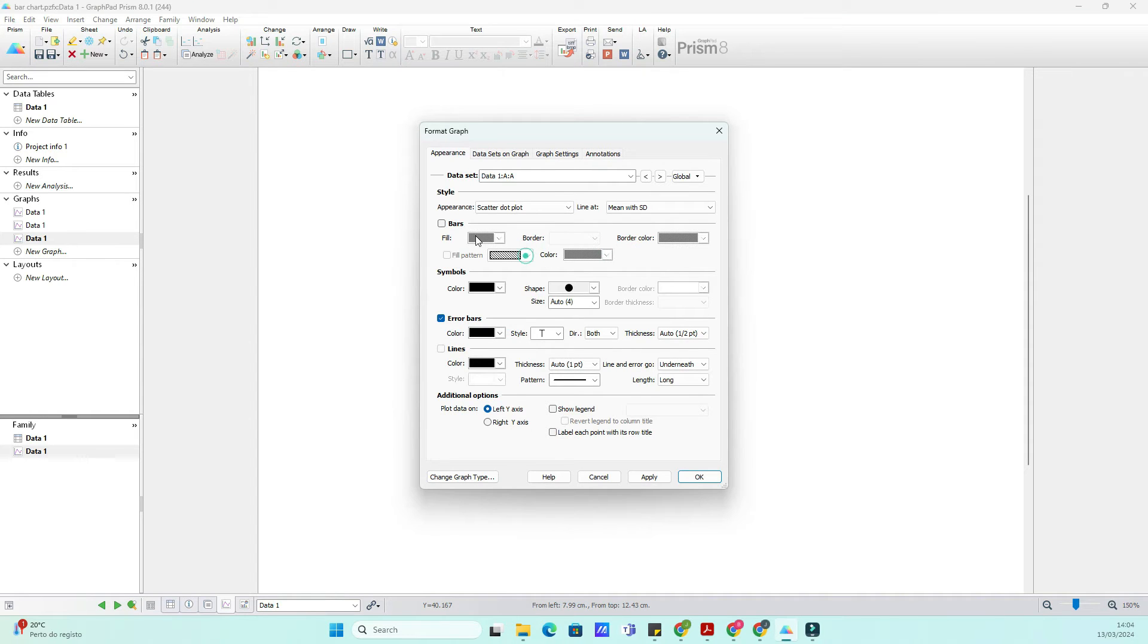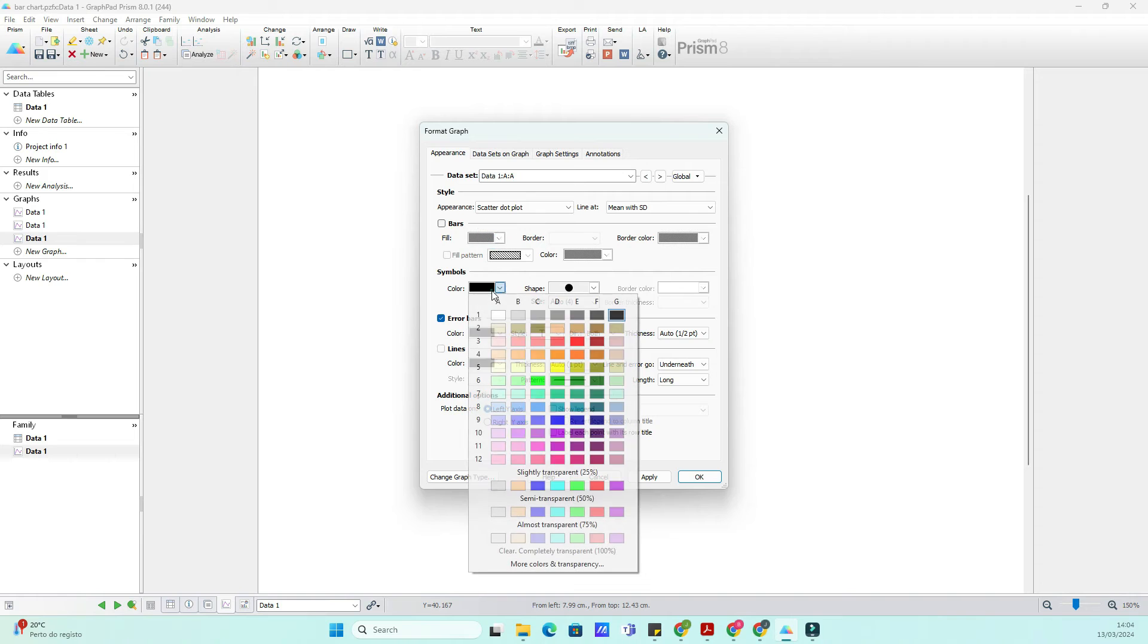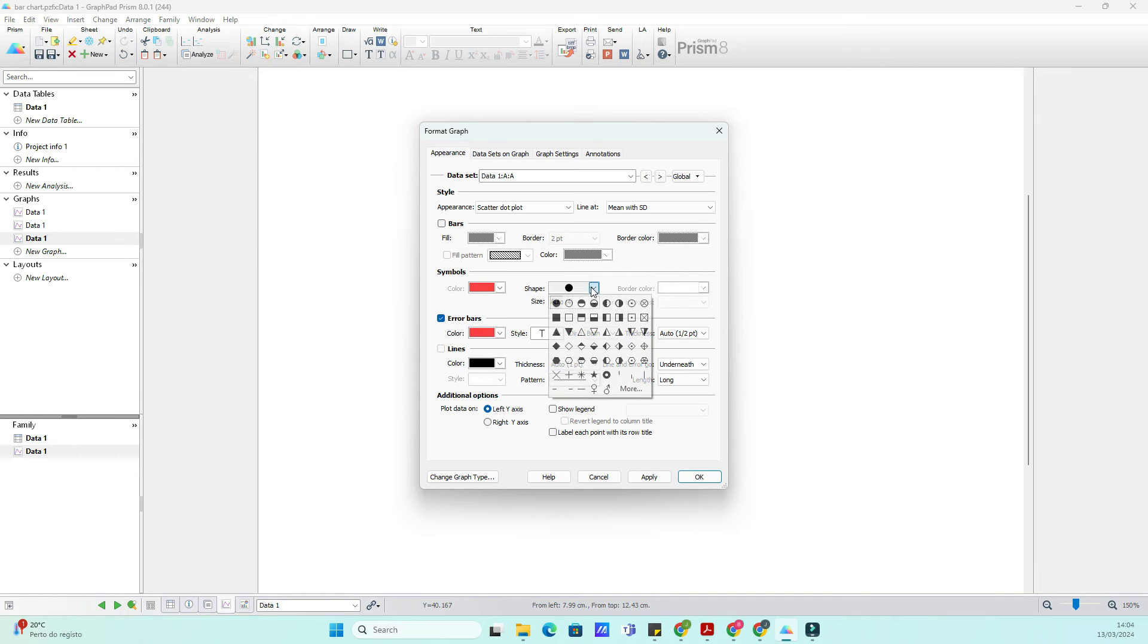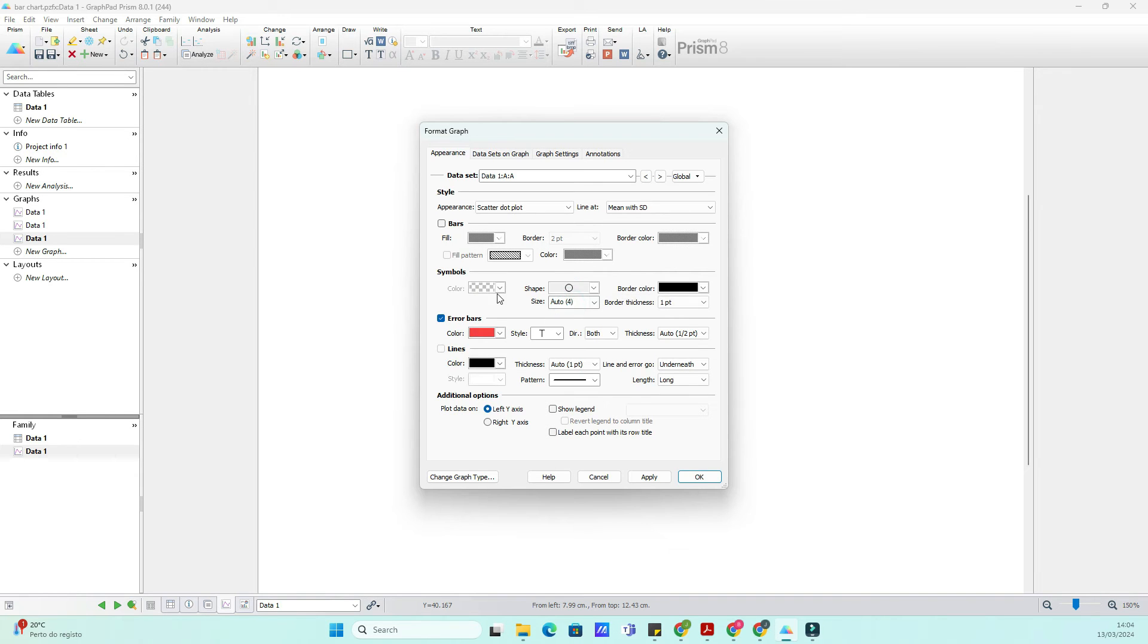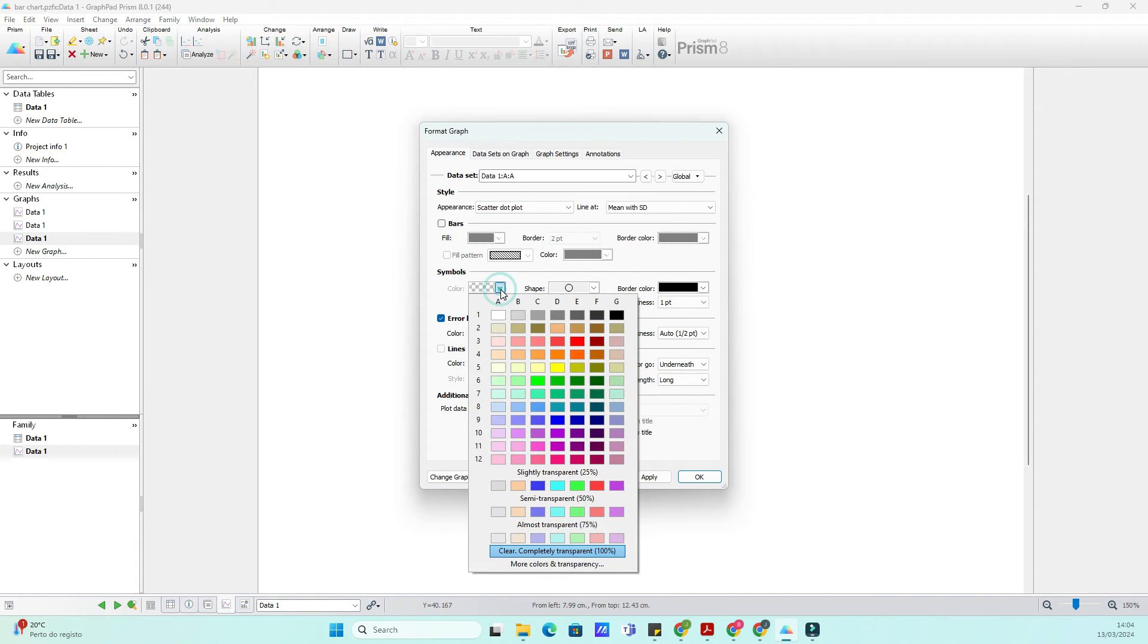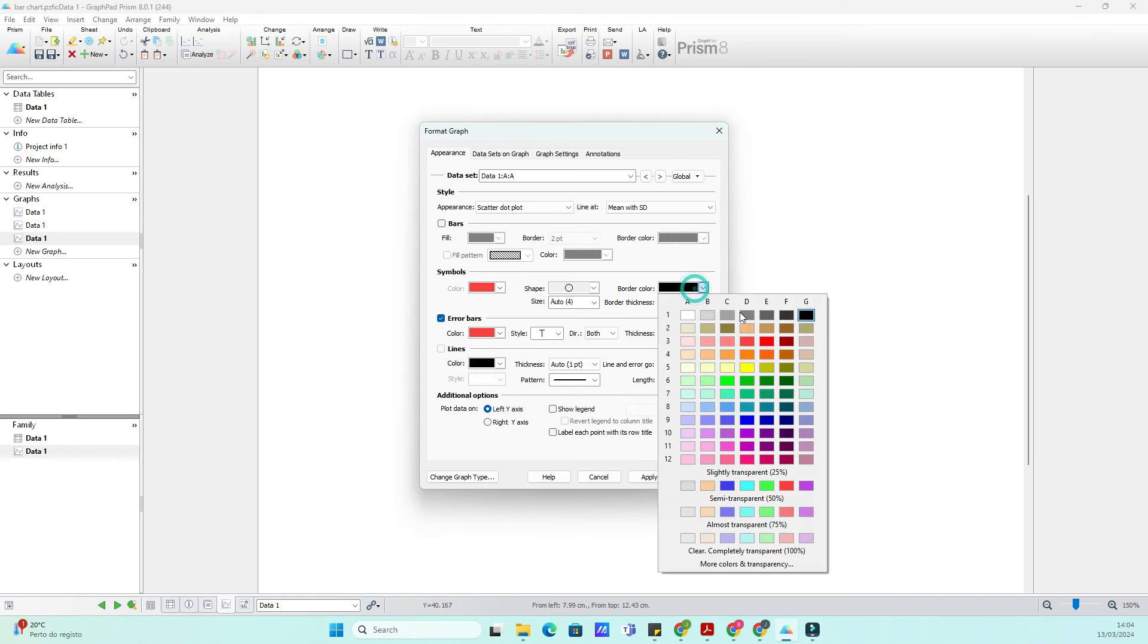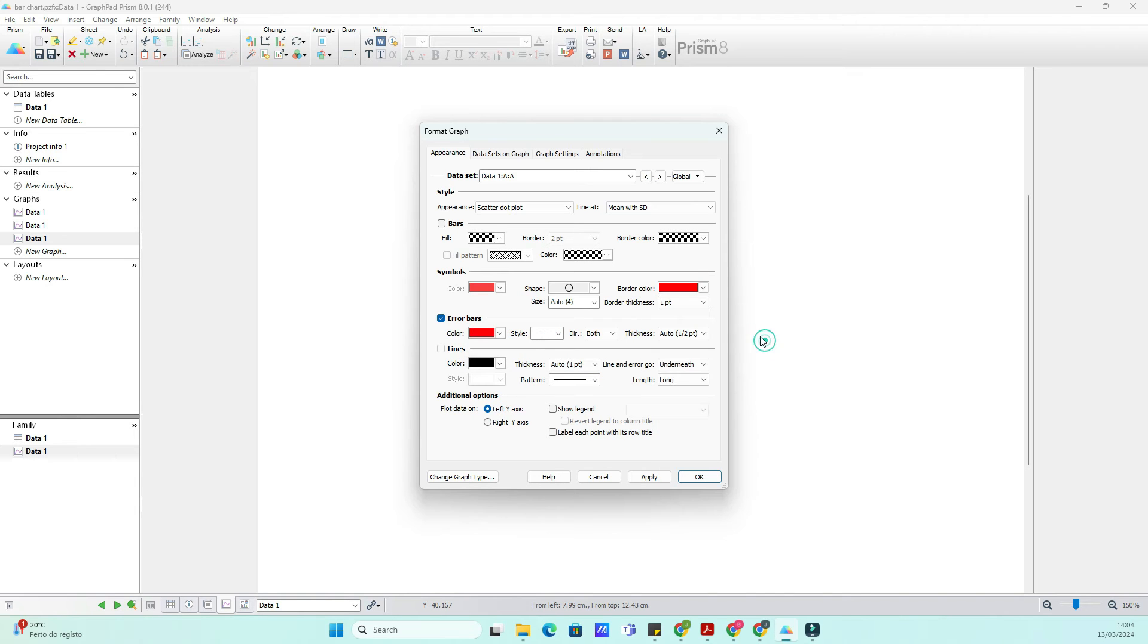Click on the Format tab or double-click on the graph. Here, you have a plethora of options to customize your plot. Let's start with the aesthetics. By playing with these options, you can make your data points pop, ensuring they're visually appealing and easy to distinguish.